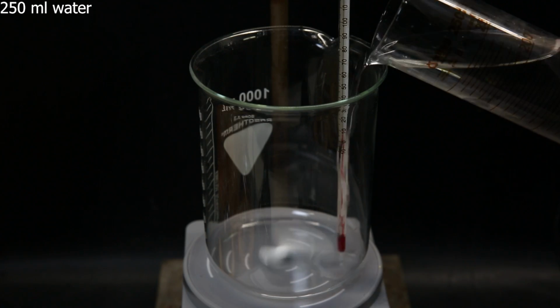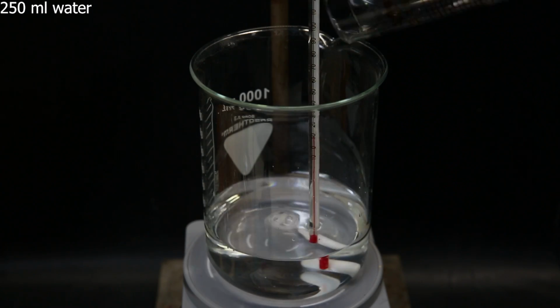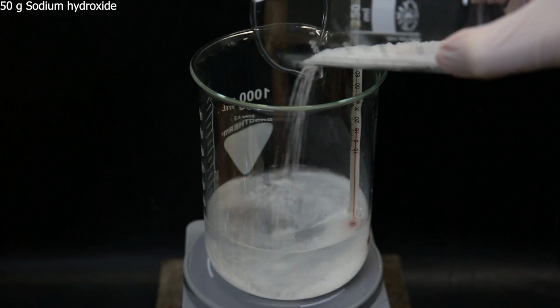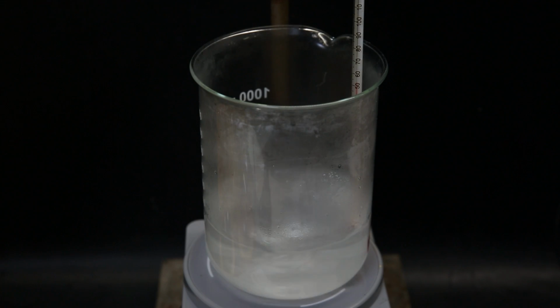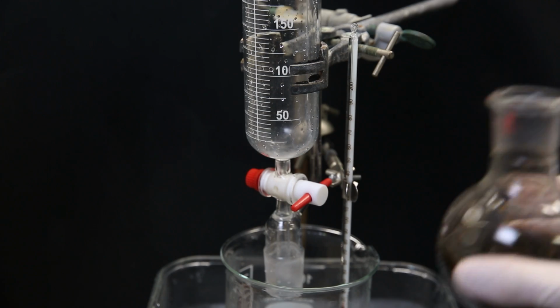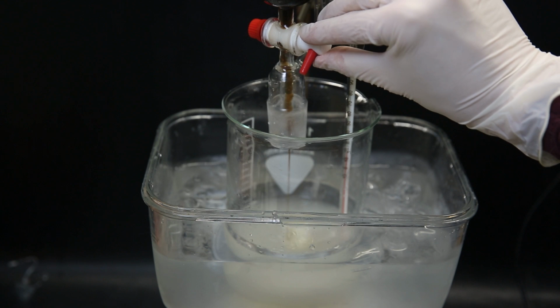Now I set up a large beaker with a thermometer and add in 250 ml of water. Then I add 50 grams of sodium hydroxide and dissolve it to make a 20% sodium hydroxide solution. I then set the solution in an ice bath to cool it down. Then I hover a dropping funnel above the beaker and add in all of the black mixture. Then dropwise I add it to the sodium hydroxide solution.